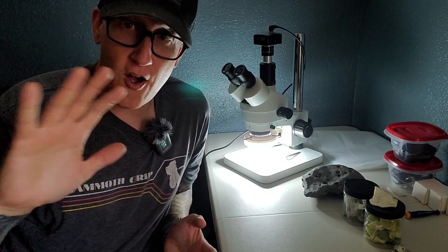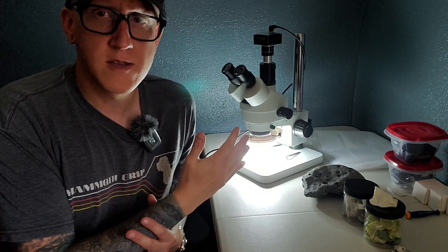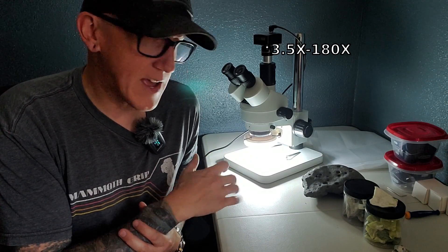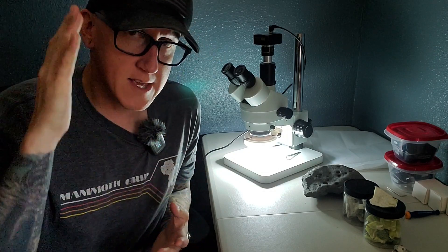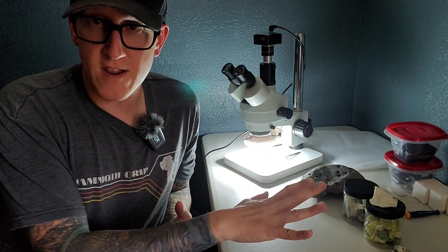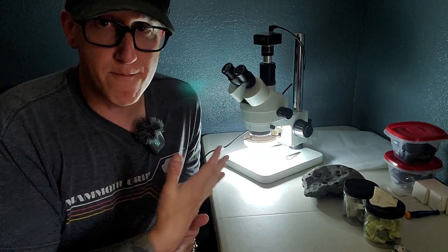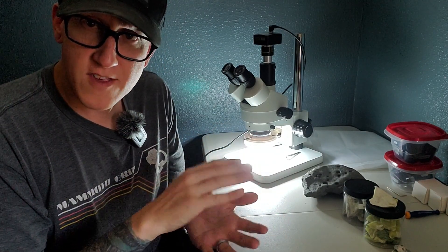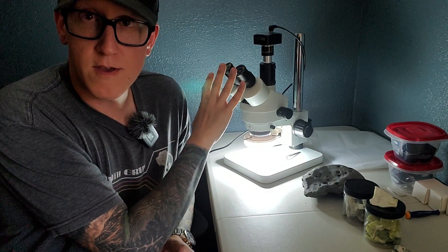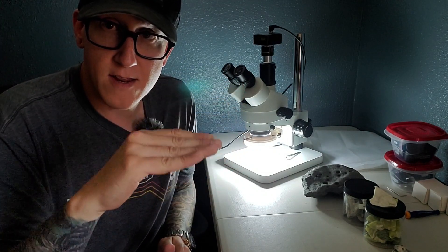I've had the microscope a couple of days now and it is mind-blowing. To be able to look at rocks and minerals at high magnification — this goes from 8 to 180 power. I've spent a bunch of time mostly looking at stuff in the 40 to 80 power range, which seems really, really good. The level of detail — I've already answered so many questions. One thing I've learned: the depth of focus is very little. When you're looking through the microscope and trying to focus on something thick, you can only get portions of it in focus at any one time.